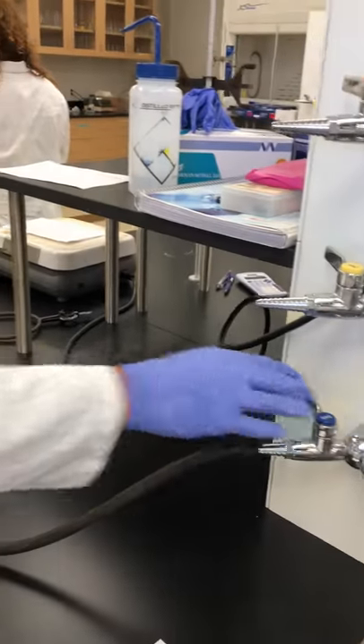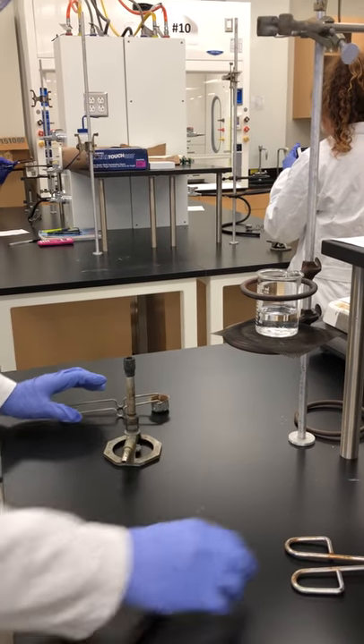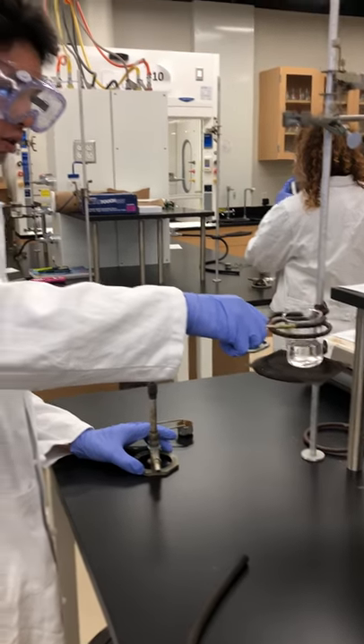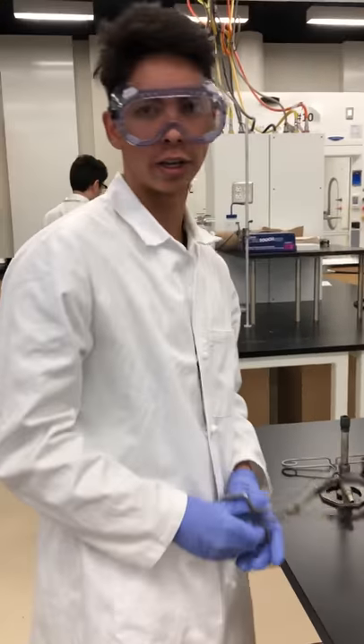Shut off the gas right here. We're going to close the gas valve. Take off the hose. I'm going to use the tongs to pick up the beaker. I'm going to place it on the desk right here. And we're done. Thank you.